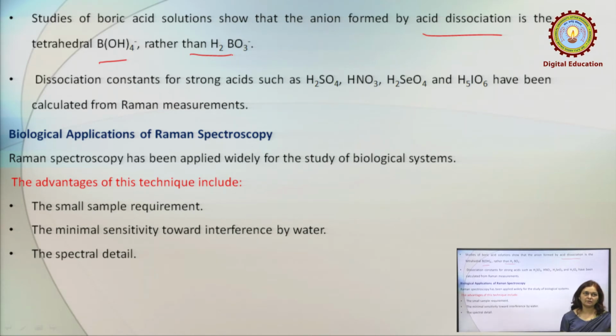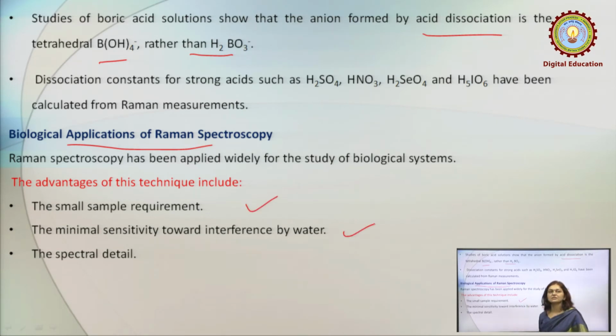In addition, there are many biological applications of Raman spectroscopy because of the small sample requirement and minimal sensitivity towards interference by water.